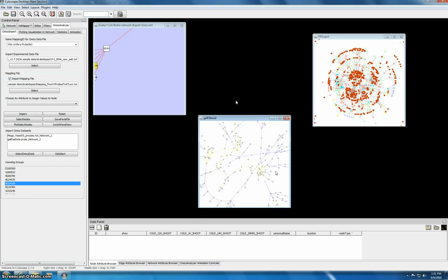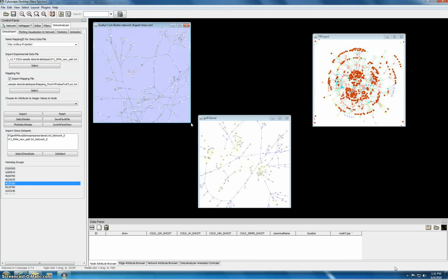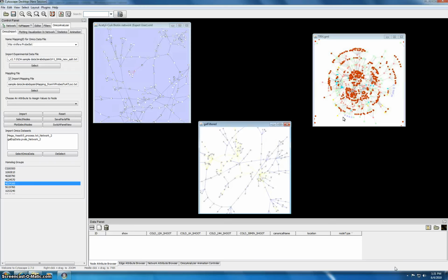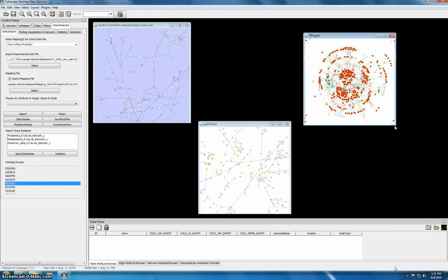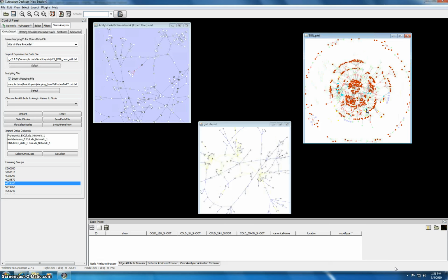Biological networks and imported omics data in Cytoscape, it is important to visualize the data sets in a certain network context, which may reflect certain design principles or biological processes, such as network motifs and modules. Omics Analyzer enables biologists to examine behaviors of the imported omics data sets in specific network contexts.